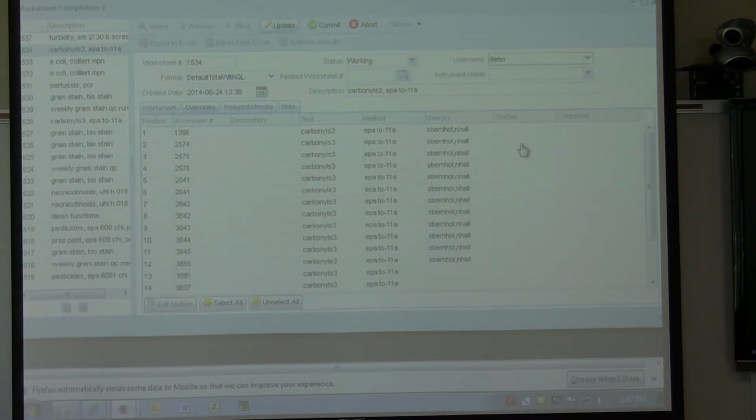So now previously for QCs, there was no place to have the date time stored in the database, is that correct? There was for started date and user, not completed date. There still isn't for completed date. See how store completed doesn't mean anything. So for QCs, previously, that wasn't stored. There was no place to store the users. So now there will be.